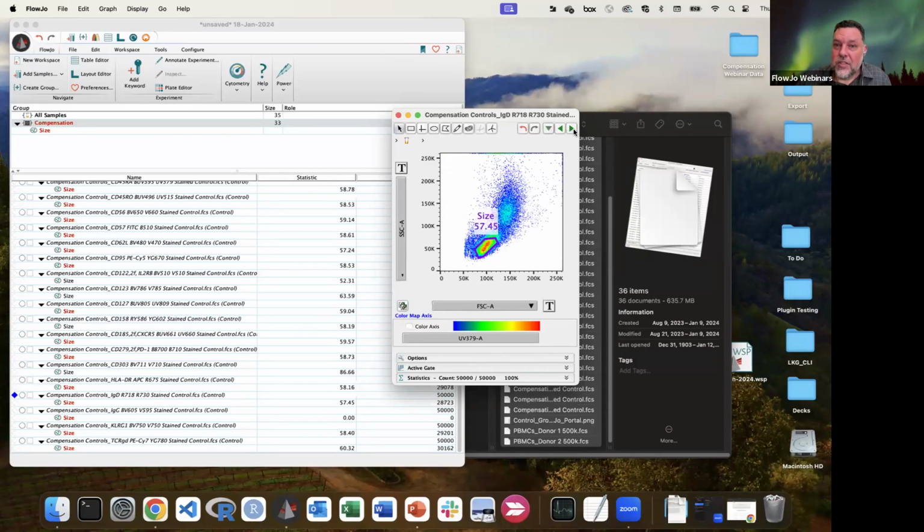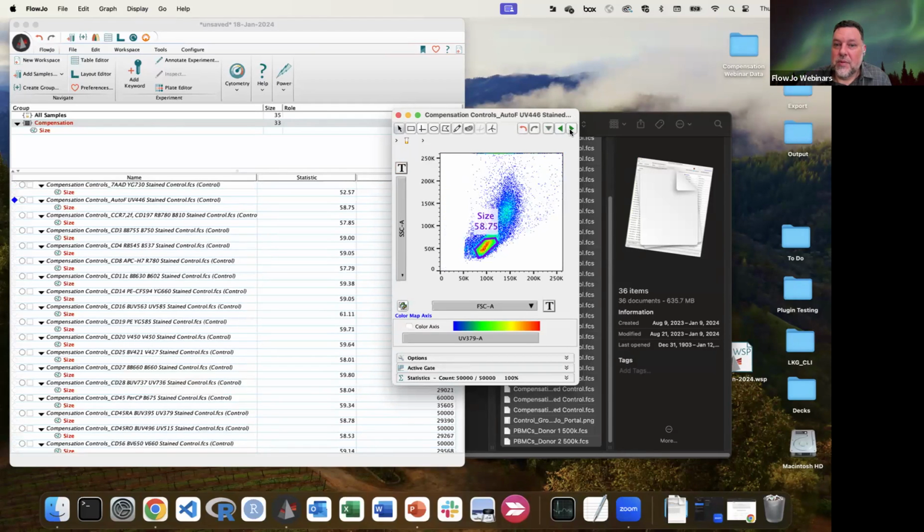And then I'll get to one or two which are not lymphocyte markers, right? And I probably have already passed, but we might see this later. This one's really wonky, and I'm just going to cheat here, by grabbing more cells. And I know this is kind of, I didn't make these samples, so I don't know. But for some reason, there's only 7-AAD signal in these cells that are really high.